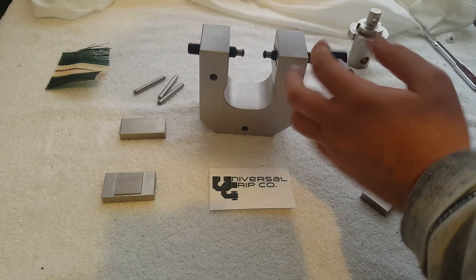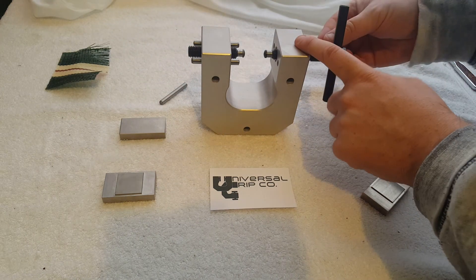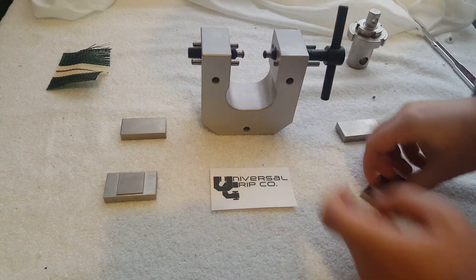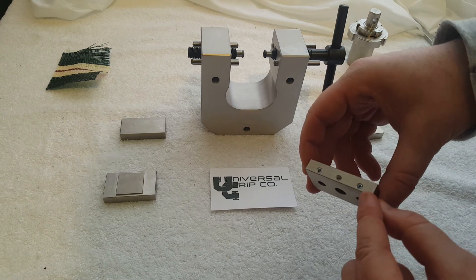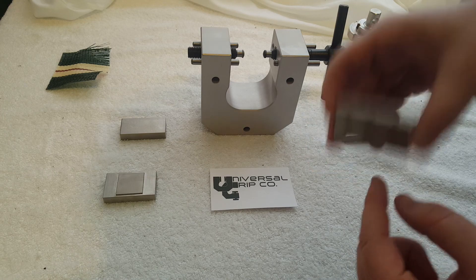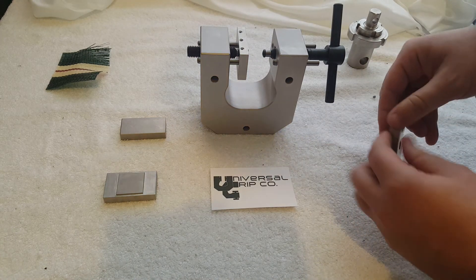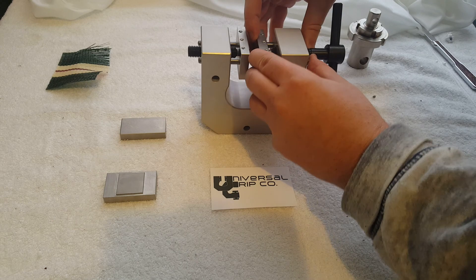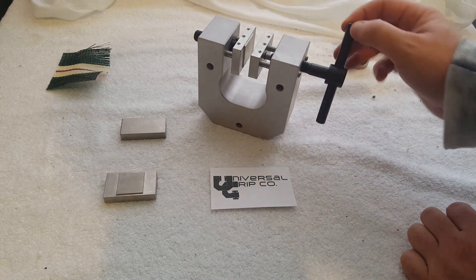These attach onto the vise grip with some set screws. We load these in, and then the jaws attach on and tighten down with these metric hex screws right here. There's our fully assembled vise grip.